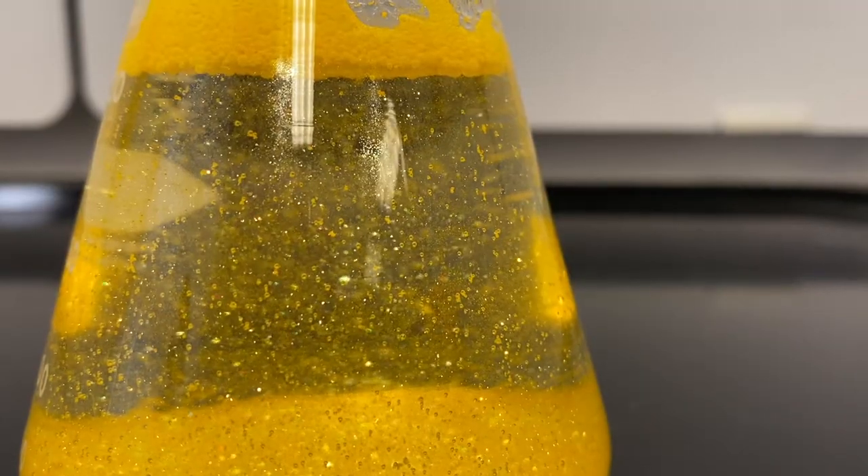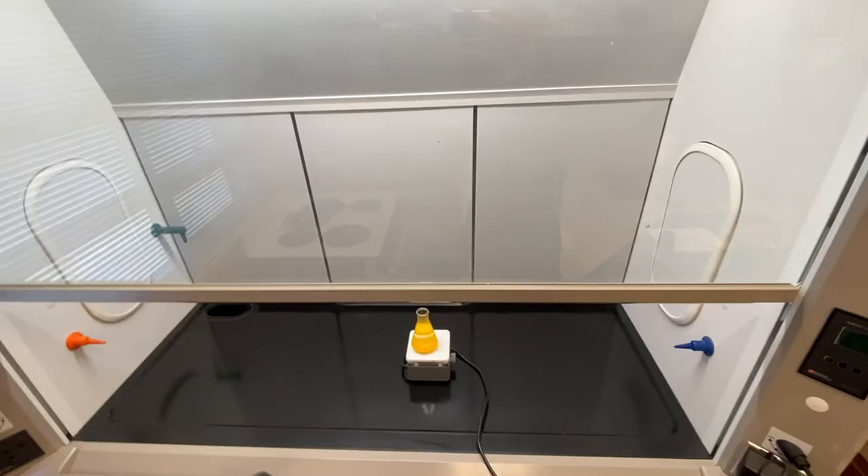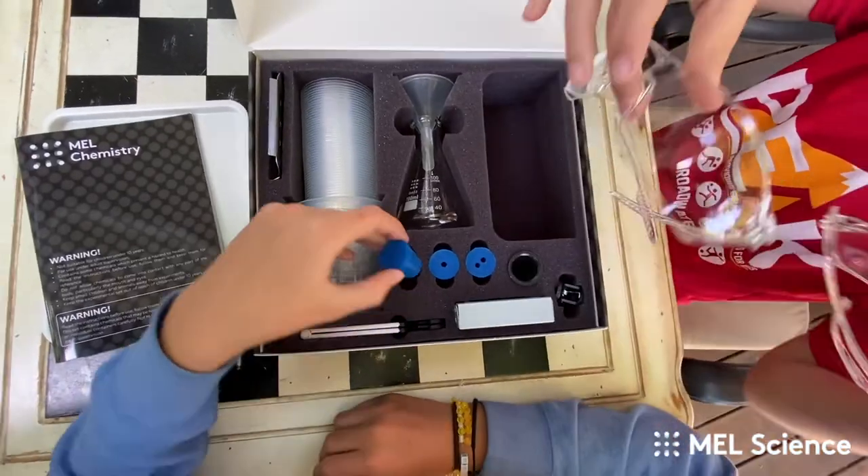They call this one golden snow, or golden rain, or Midas magic. I like to call it the golden snow globe. Stick with me — I'm gonna show you how to make a golden snow globe that is actually quite toxic. Don't do it at home. In fact, we're gonna do most of it in the fume hood to play it extra safe. Stick around and I'll show you how you can do some science experiments at home and have them shipped directly to your house.